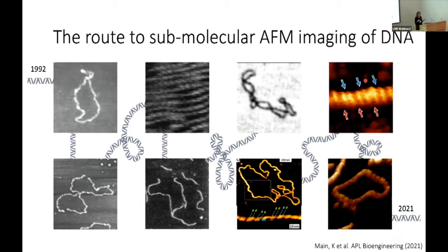And this was a huge step forwards for what AFM was able to do. And that was amazing, apart from the fact that these were both done on home-built systems that only existed in 2 labs in the world.